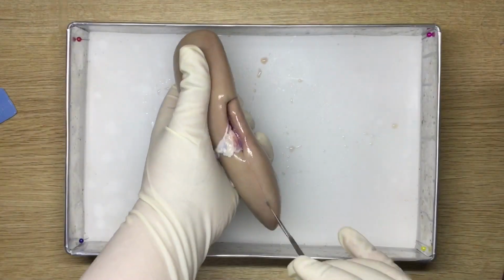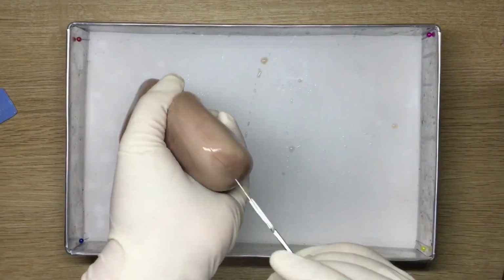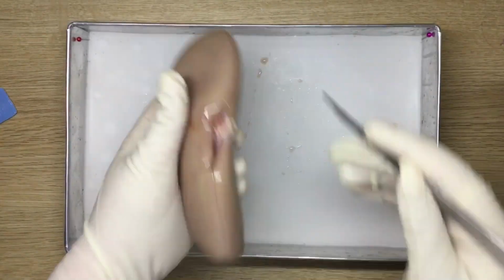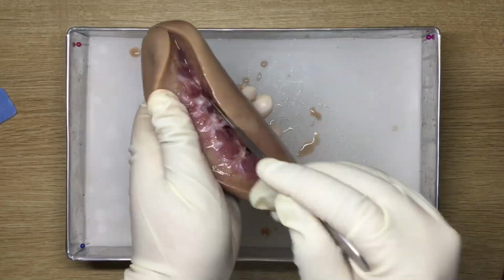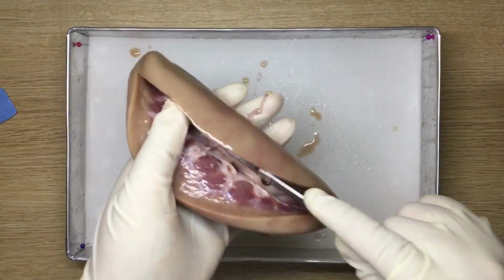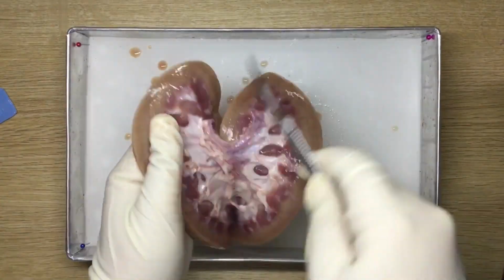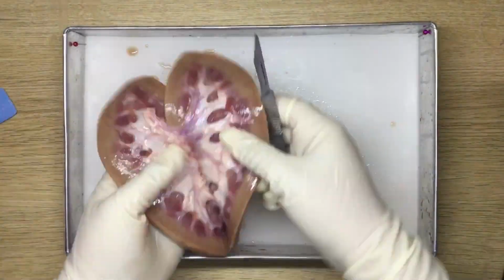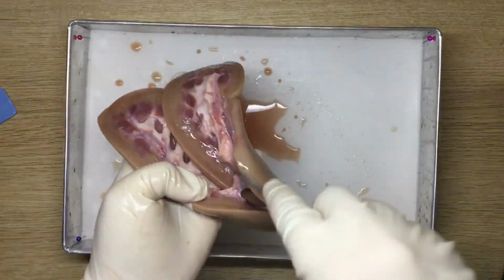As we know, the shape of this kidney is like a bean, and the kidney of a pig is the same as the kidney of a human. In cutting a kidney using a scalpel or a scissor, make sure that you only get one chance to cut it, and there's no way to redo this. And be careful to cut because it is a soft tissue.